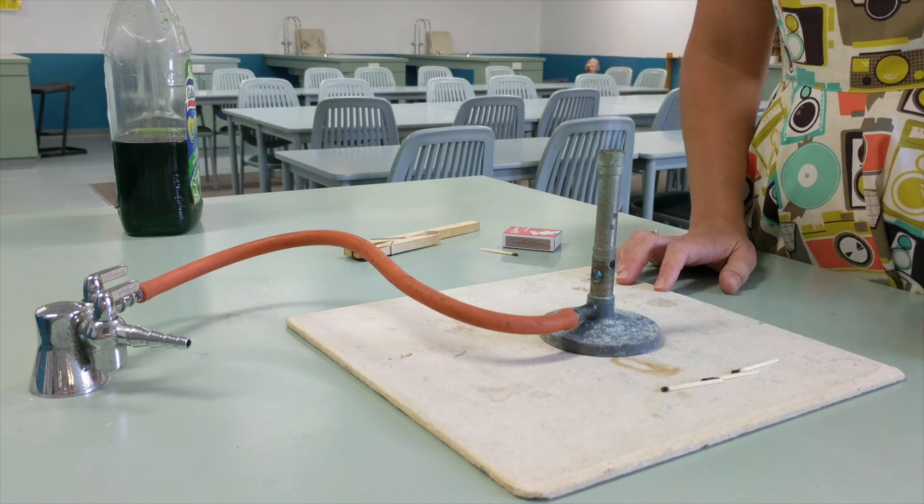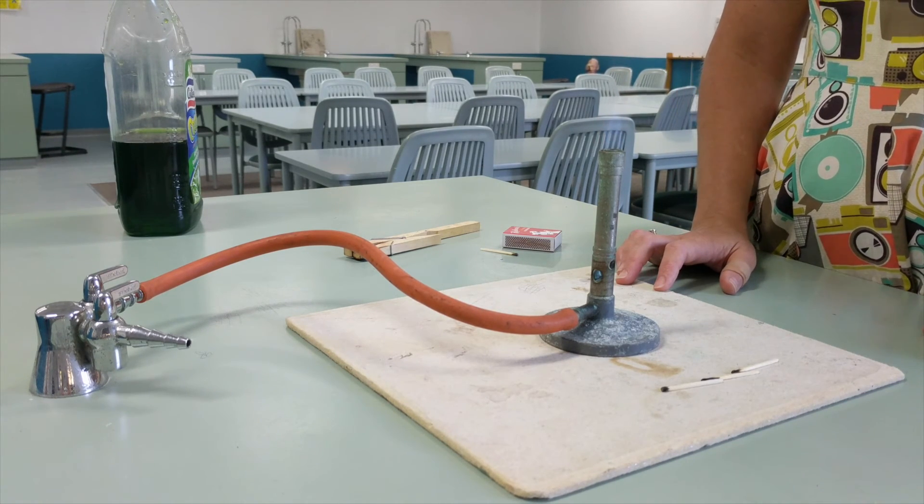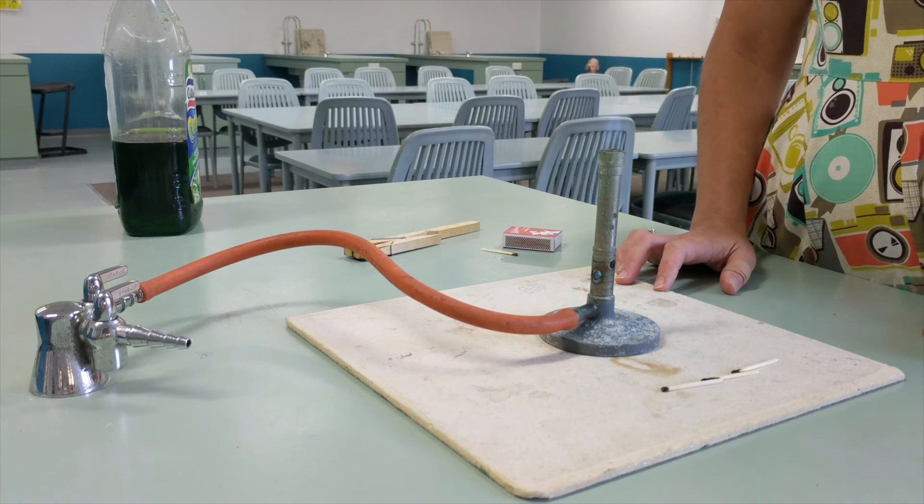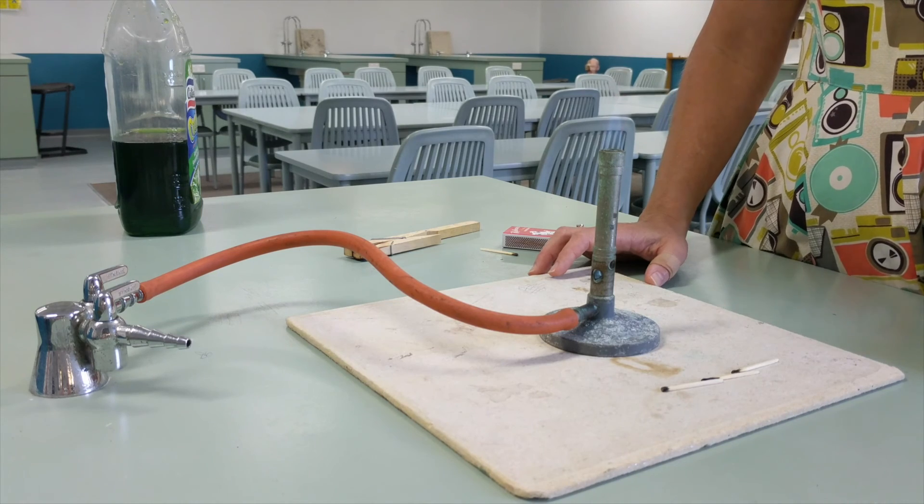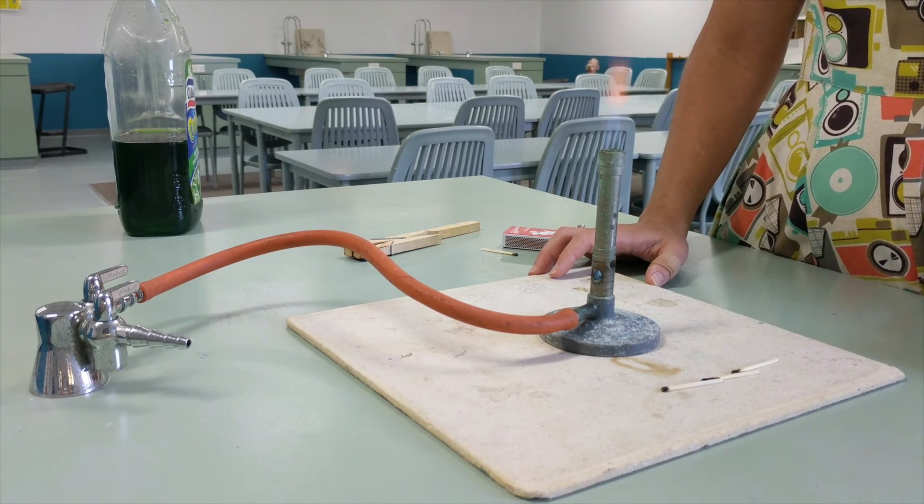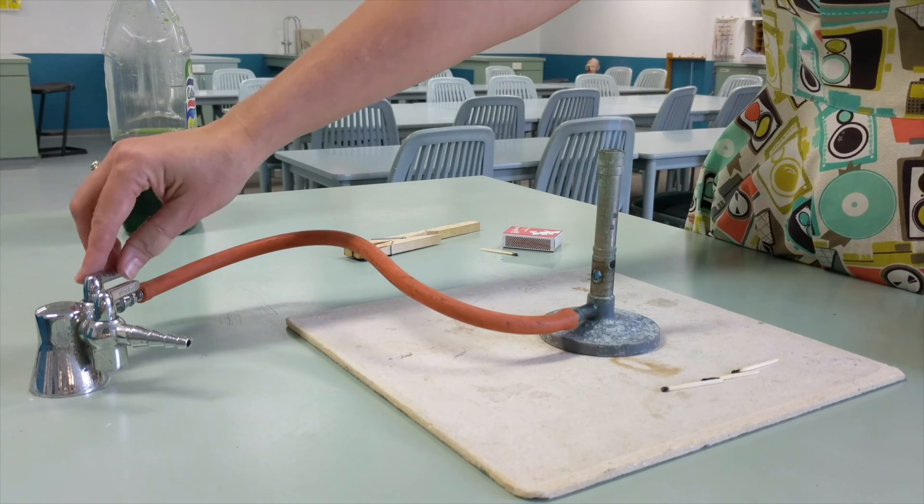When it's time to turn the Bunsen off, don't blow it out. Don't blow the flame out because then you might accidentally leave the gas on, and dangerous gas would start to build up in the room. In order to turn the Bunsen off, all you do is simply turn it off at the gas tap.